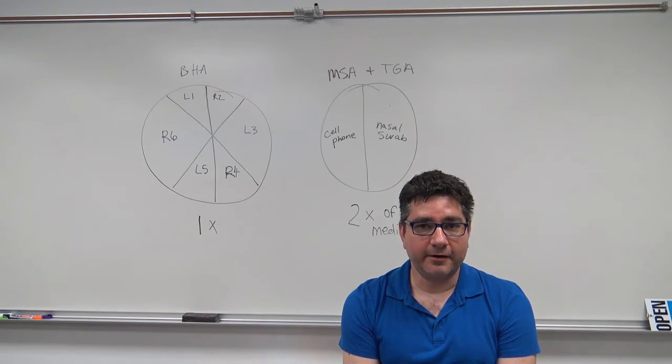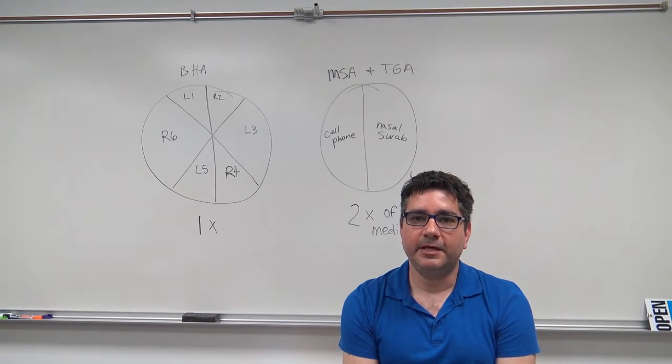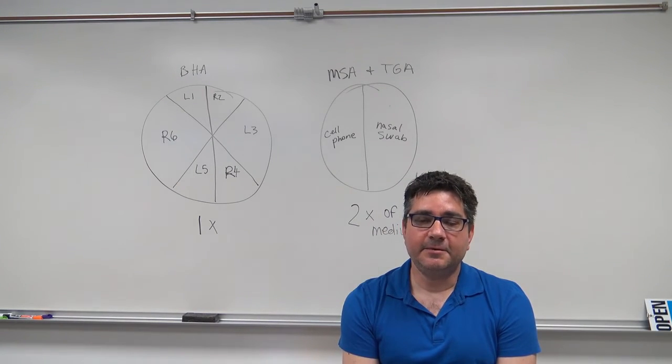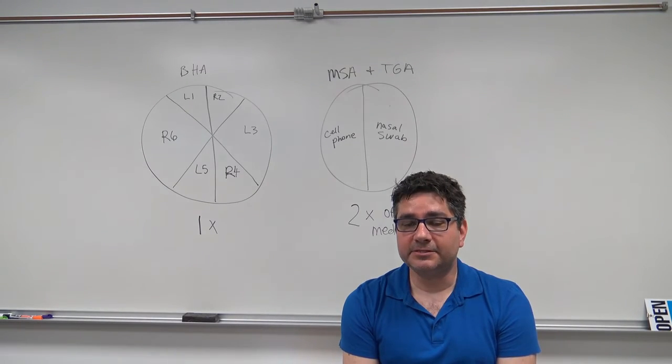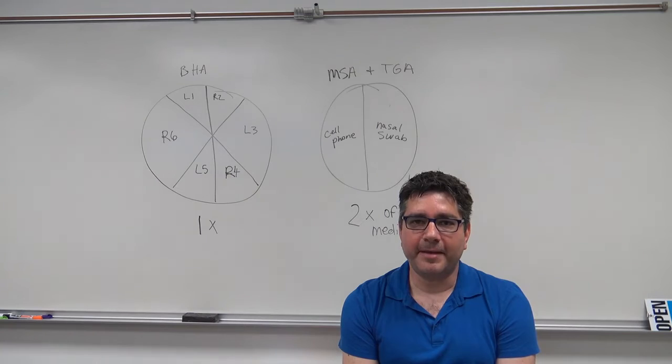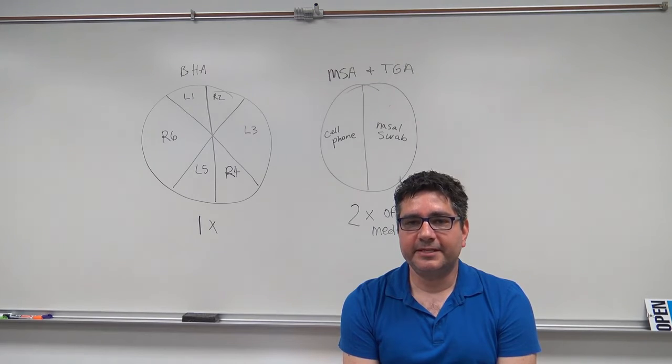Tellurite glycine agar is the second medium that you will be testing. This medium is selective for pathogenic staph species and inhibits the growth of most other bacteria. It's differential by possessing potassium tellurite, which is reduced by pathogenic coagulase positive organisms to form black colonies. Today you will be following the same procedure as with the mannitol salt agar. Your TAs will streak the Staph epidermidis on a separate plate.